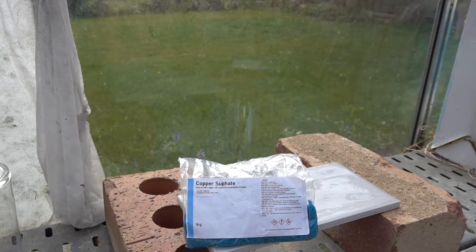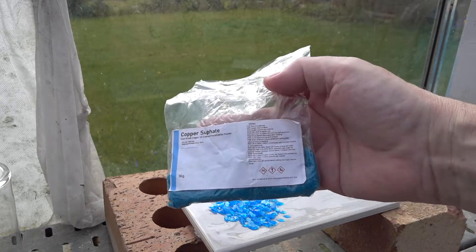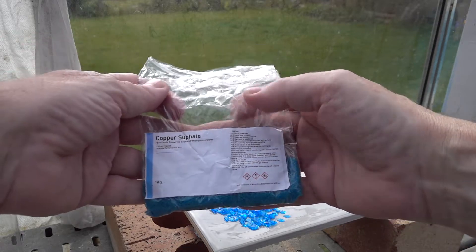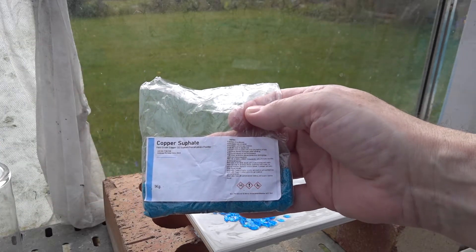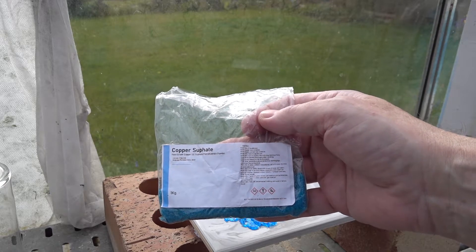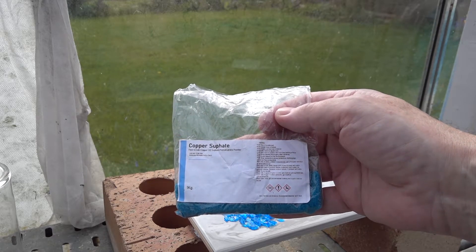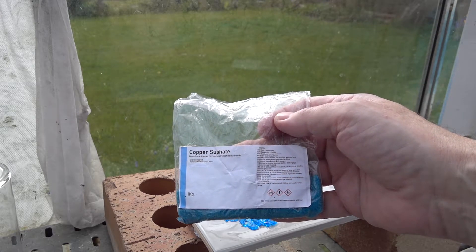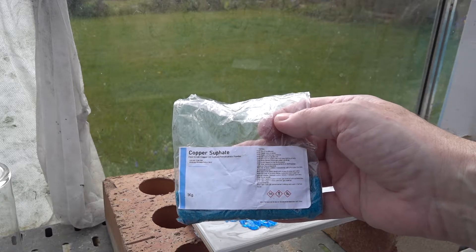Here we've got some copper sulfate from an online chemical supplier. If we read the hazard warnings, it says it causes skin irritation, is toxic if swallowed, and is very toxic to aquatic life. So we need to be careful with it. If it comes in contact with the skin, we need to wash our hands immediately.